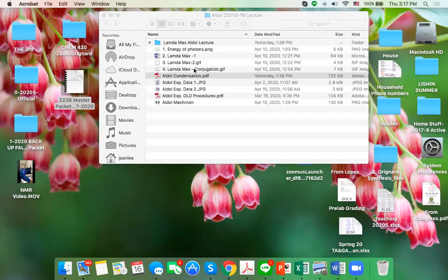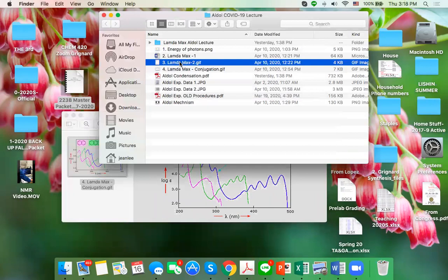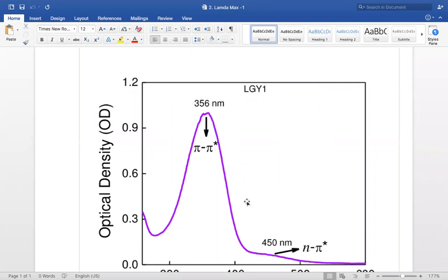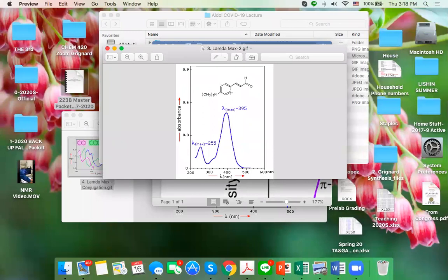how about another example, okay? I just want to show you, if I give you a molecule and then you dissolve that compound in an appropriate solvent. For UV spectroscopy, we usually use ethanol because ethanol will not pick up any signals in the UV range. So, okay, right here. A molecule like this, do you see a conjugated system right here? Okay. And then I dissolve it in ethanol and then I run it in the UV spectrometer.